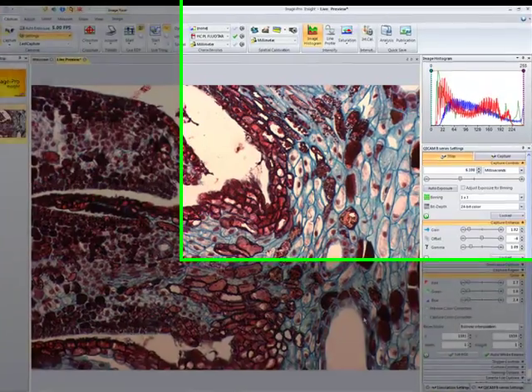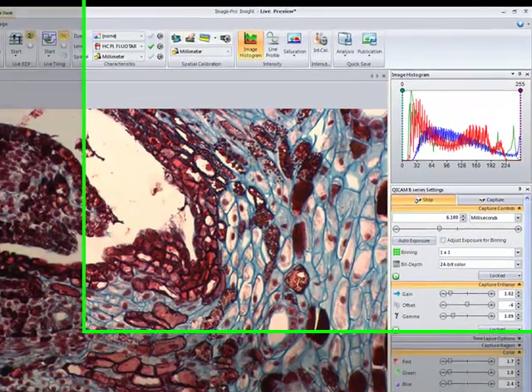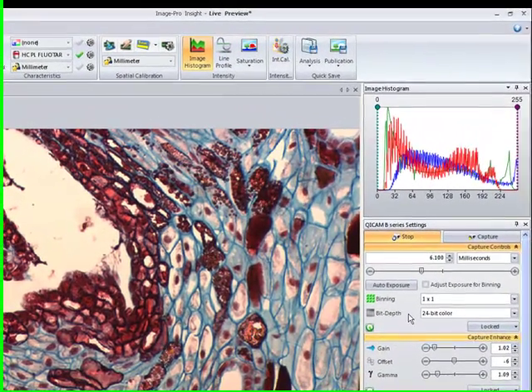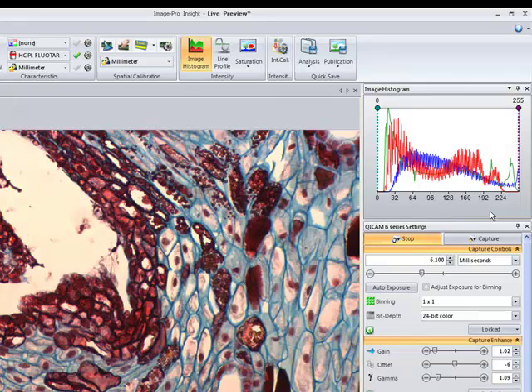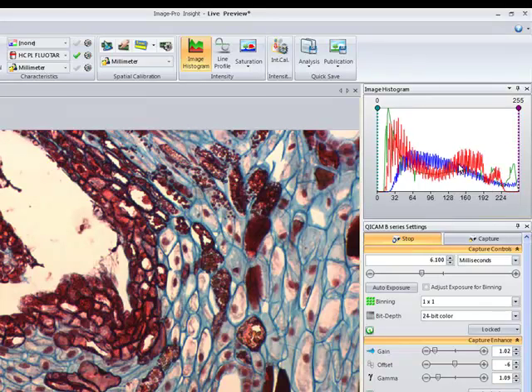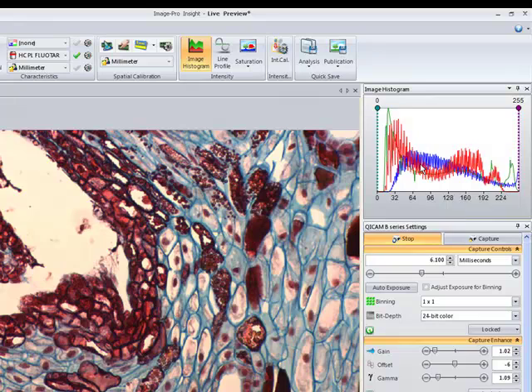Here we have a live image open and up in the top right corner, we see our image histogram. Now, since this is a color image, we are seeing the red, green, and blue colors in the histogram.